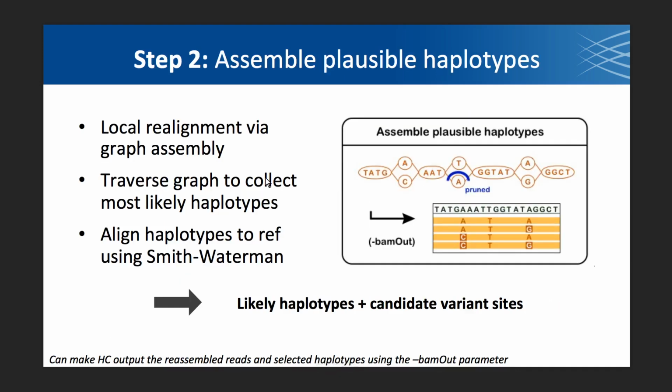So we do local assembly with respect to the reference. This is not de novo assembly. We are not going to discover large events, large rearrangements. Again, we're only looking at a small window, and we're constrained to mapping these things with respect to the reference.